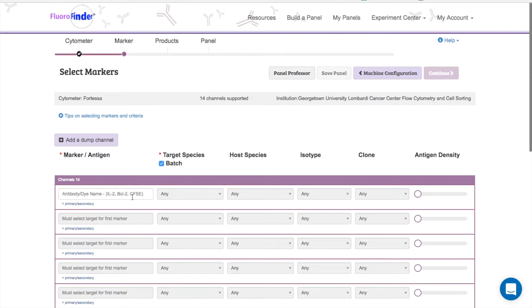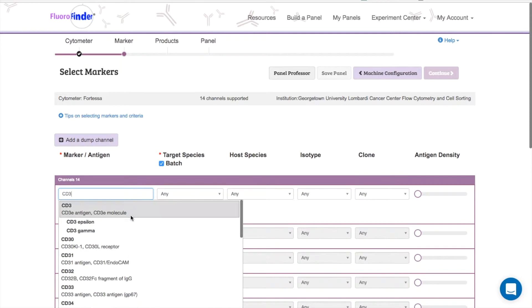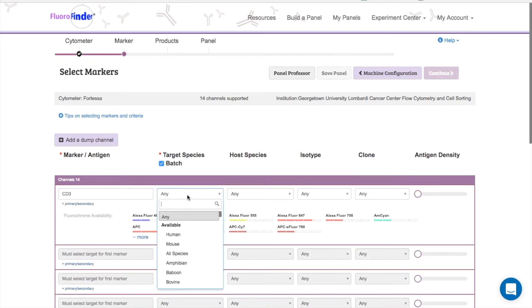Once you've selected your machine, the next step is to tell Fluorofinder exactly which markers you want in your panel. After you've input your first marker, the only other thing you're required to select is the target species which you are working with.